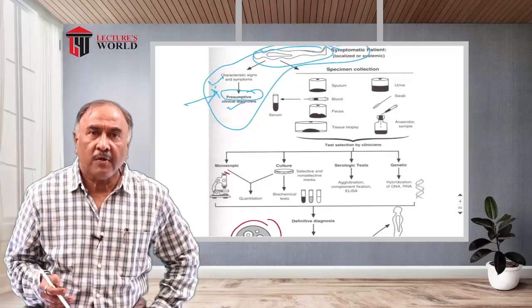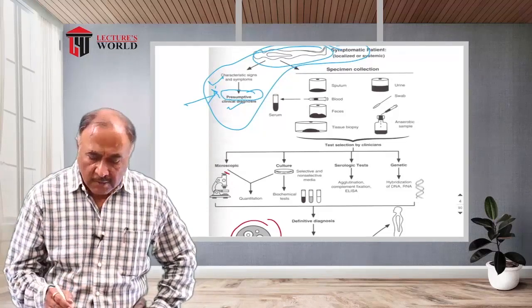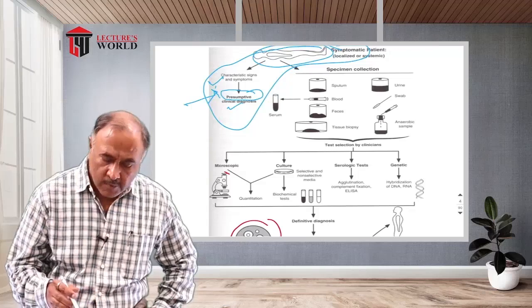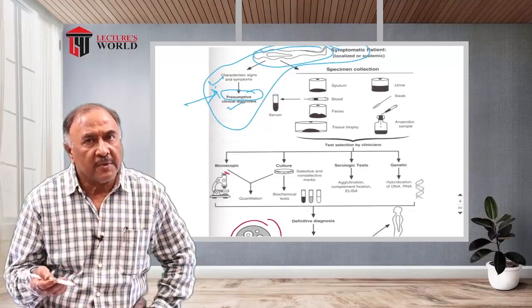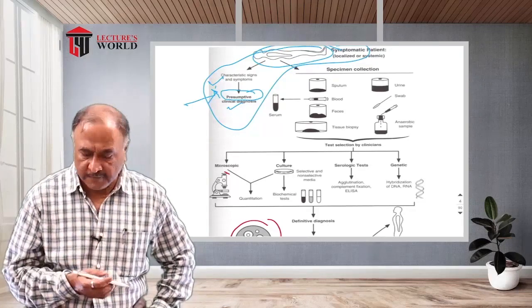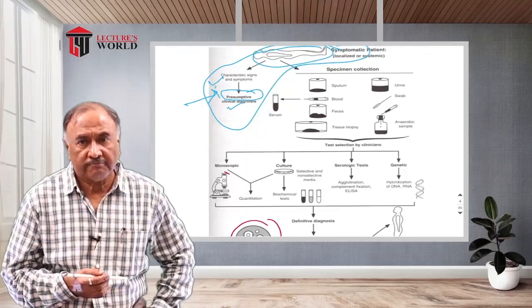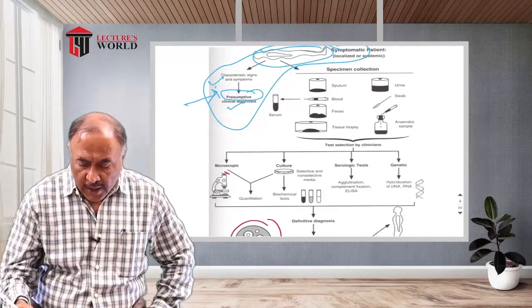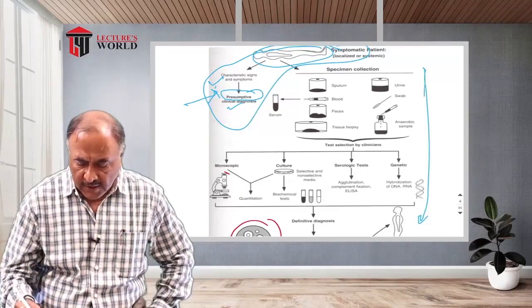And therefore, normally, the clinicians or the routine doctors would make a presumptive identification and treat the patient empirically. And normally the patient improves. But the right method is what we are now going to study here. These are the techniques.